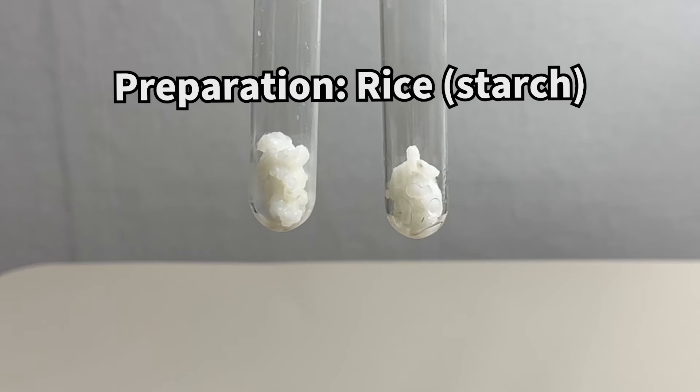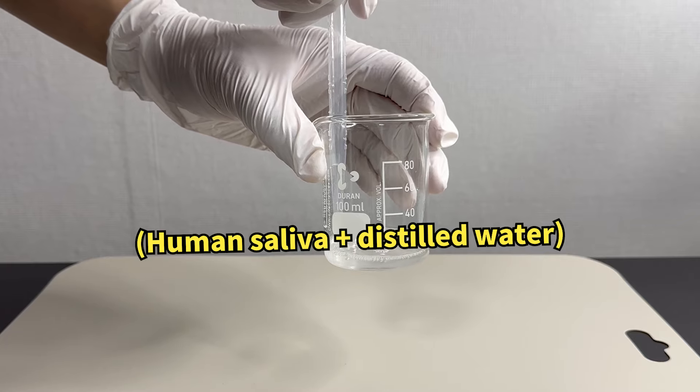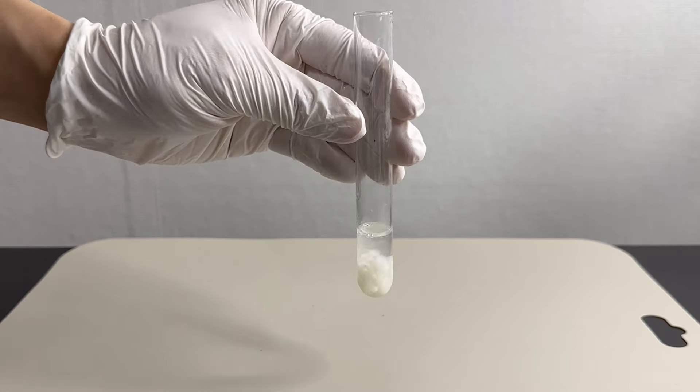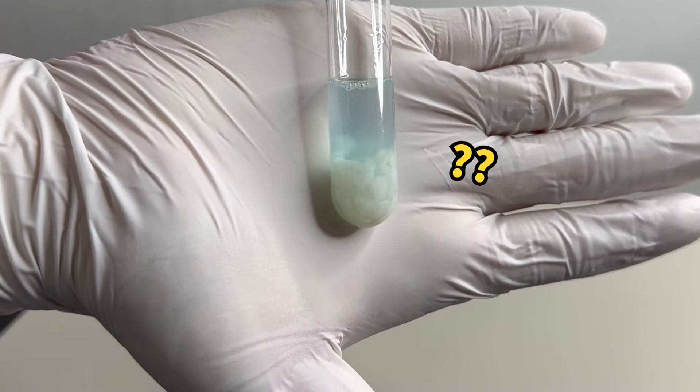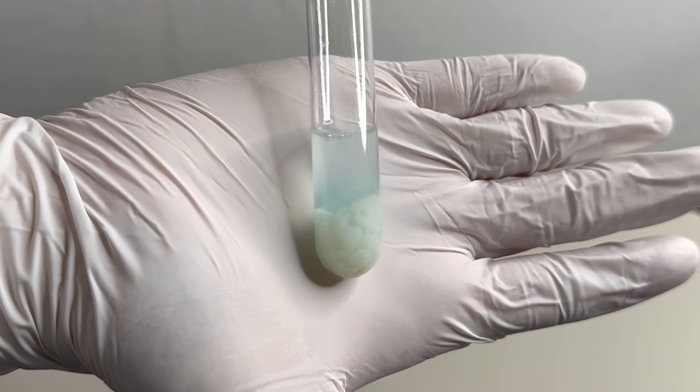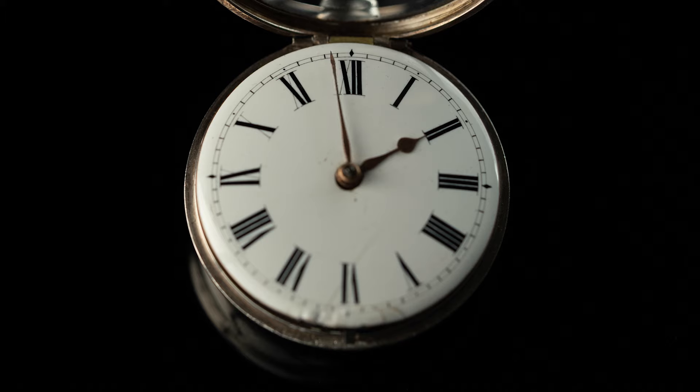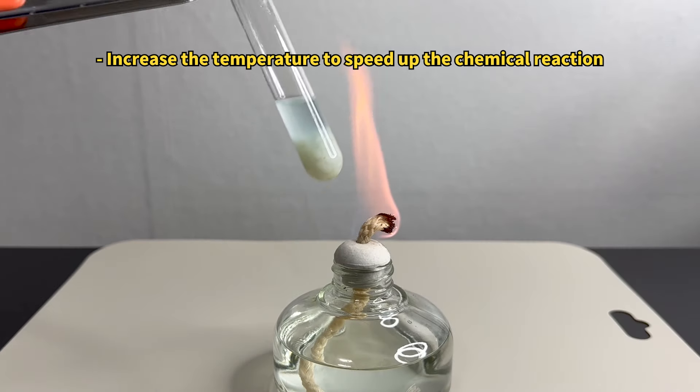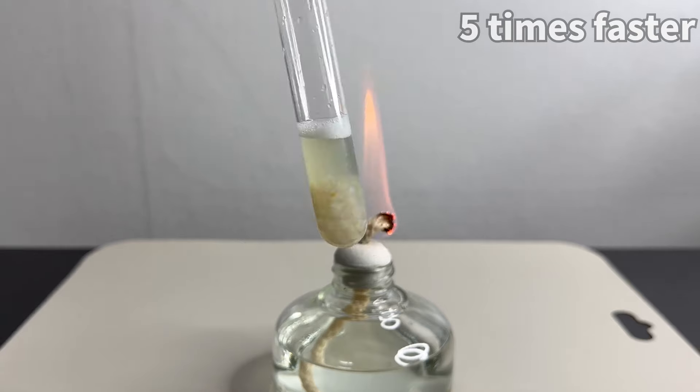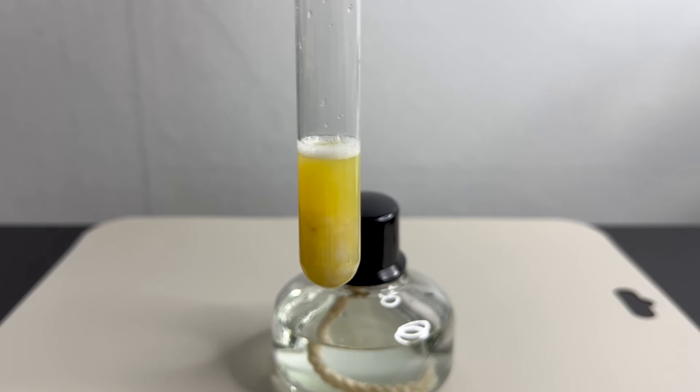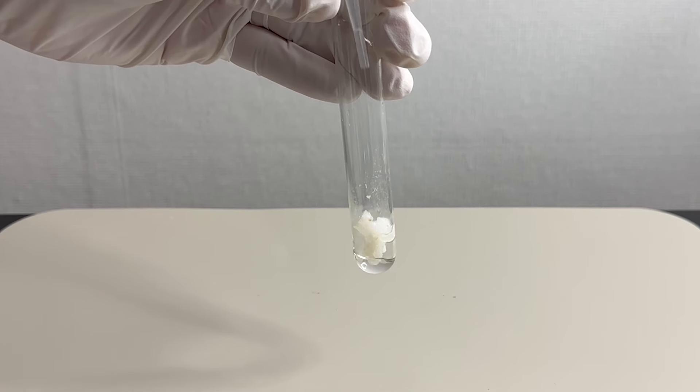We first tested human saliva by mixing it with a starch-coated rice grain and adding Benedict's reagent. Initially, there was no change. Because Benedict's reagent reacts slowly with sugars, we heated it with an alcohol lamp to speed up the reaction. Upon heating, the blue reagent turned yellow, indicating that the starch had been broken down.